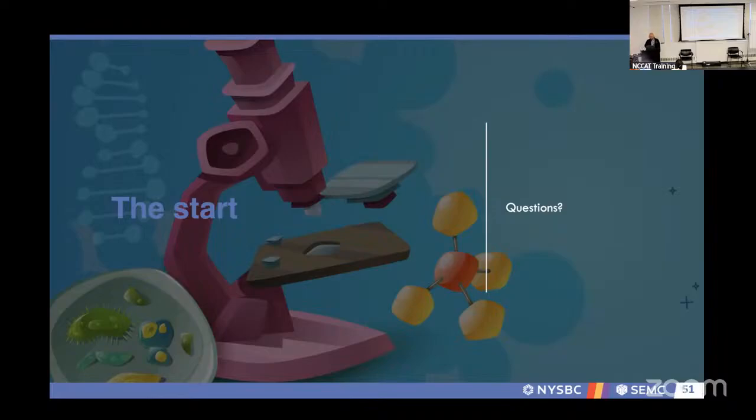Yep. So with the movies, you are staying at the same plane, you are averaging all the way through the plane? I didn't really go into it, but we typically have our sample fixed and our detector fixed during a data collection. There are certain motions, but yes, it's in the same plane. You can account for that if your sample is doming, because it's moving not just in X, Y, but in Z. You can do per frame defocus correction. That's not standardly done.